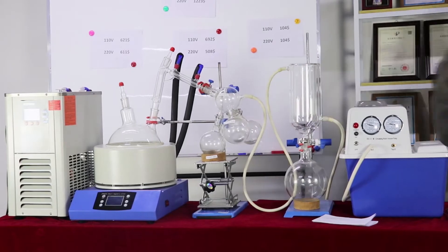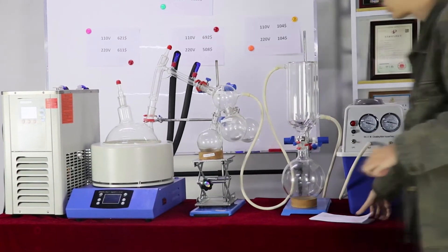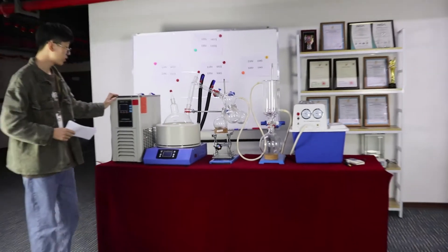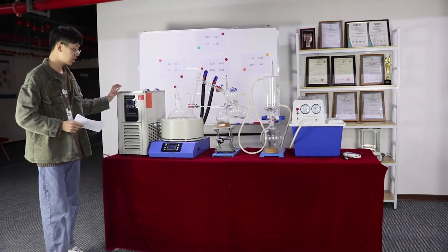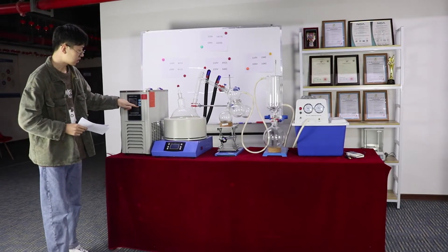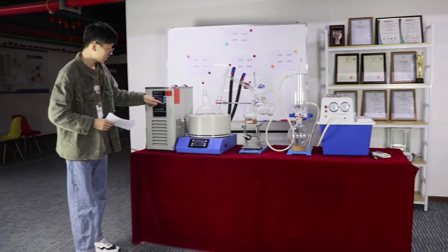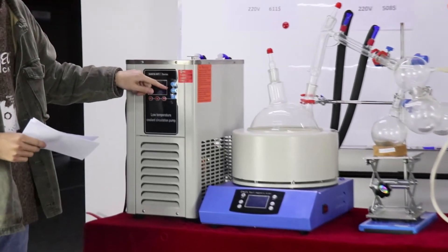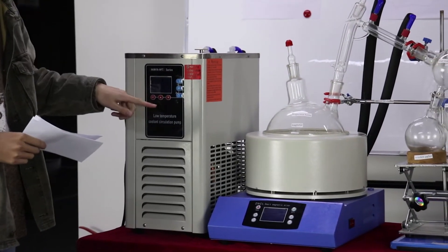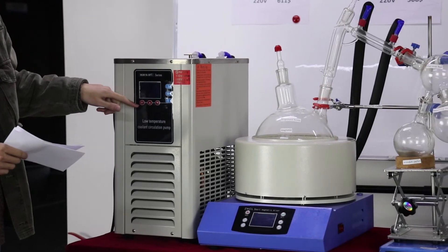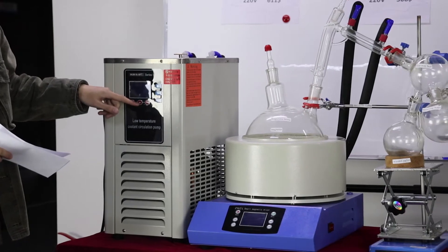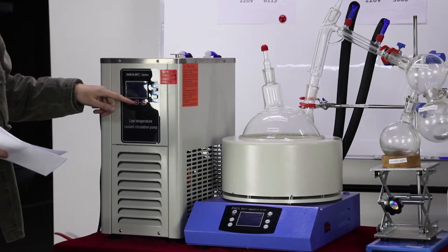This is the cooling chiller. This is the switch, refrigeration, and cycle. This is the setting. It can adjust the temperature and time.